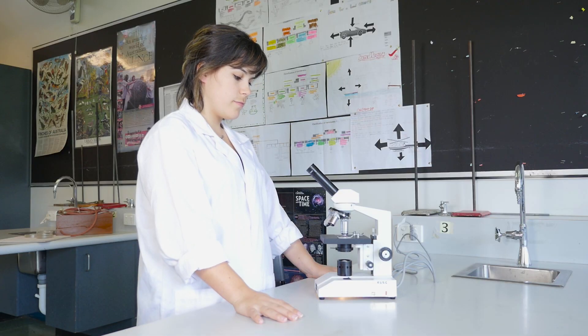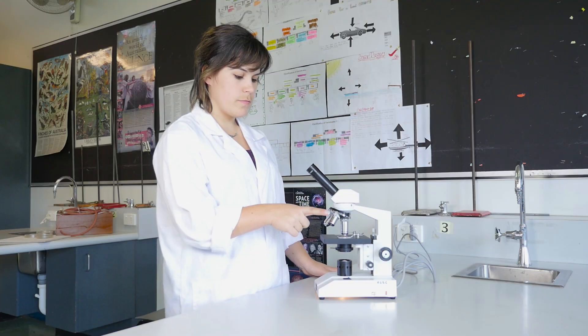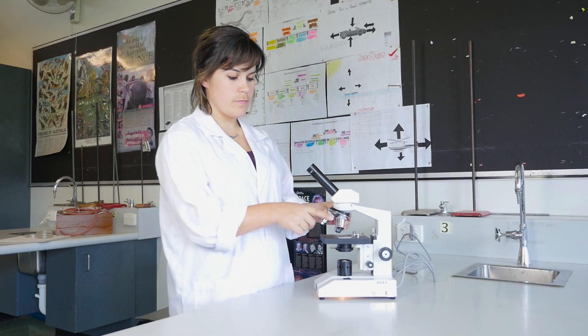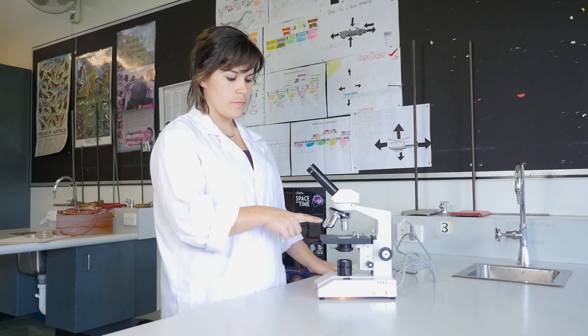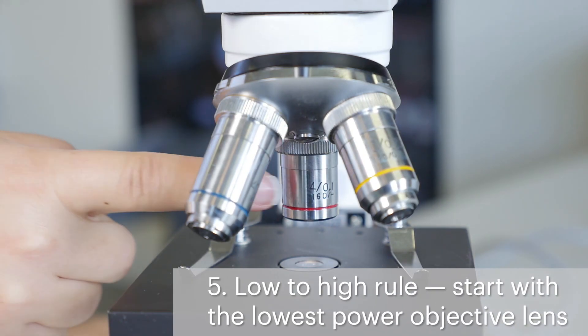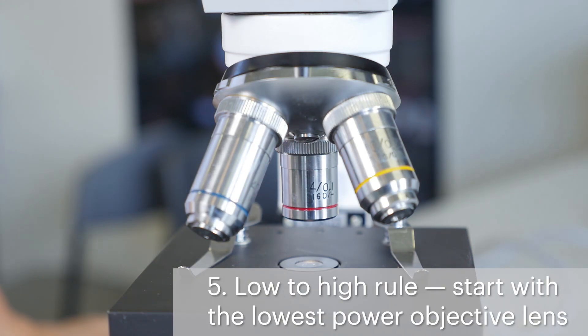Every time you use the microscope, always follow the low to high rule. Start by selecting the lowest power objective lens and later zoom in by working your way up. The lowest power objective lens is the smallest objective lens and is usually marked with a 4.